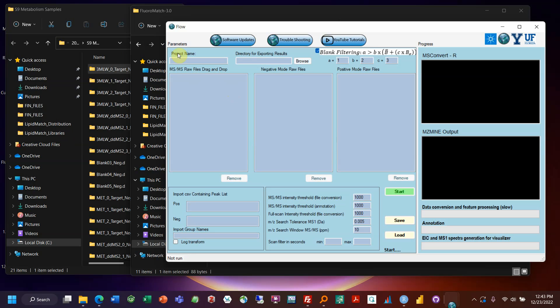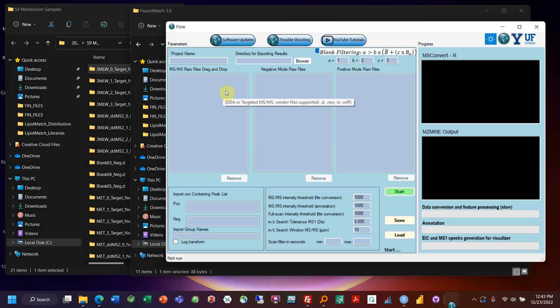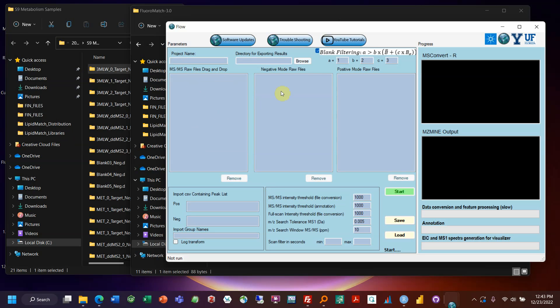Generally, targeted MSMS, data-dependent, iterative exclusion data-dependent, all those files can go in here and those can be as many files as you want. Obviously it'll take more time the more files you have and actually increase false positives. So if you have representative AFFs there's no reason even if you ran a number of samples to run a ton of data-dependent. But if you're running very different contaminated soil samples from different areas, you might want to have data-dependent for all of them.